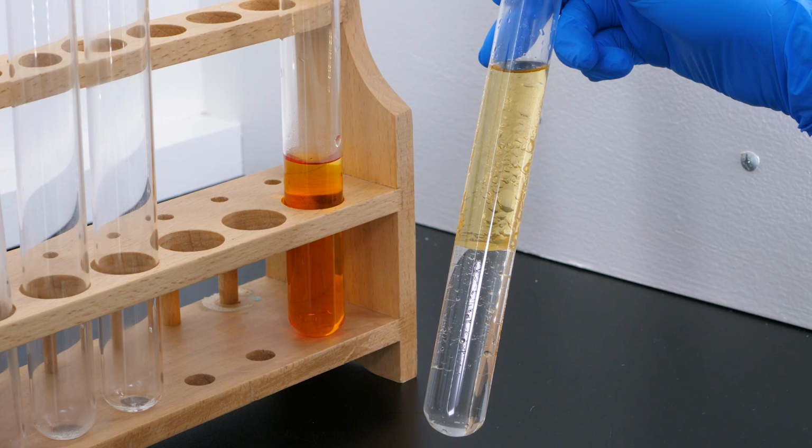When we hold the test tube near the test tube of bromine water, we see that the bottom layer is colorless, but the top layer has a slight orange color. Benzene is mostly unsaturated, but it has some chemical properties of saturation, so a slight color remains.